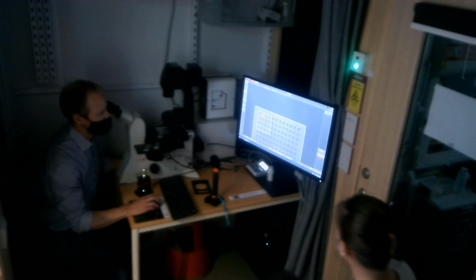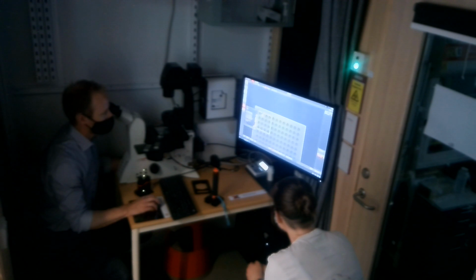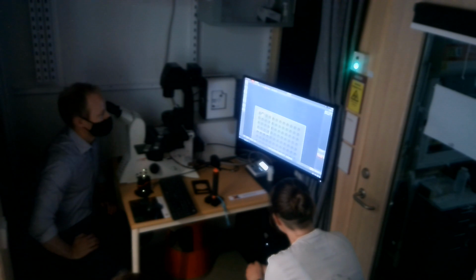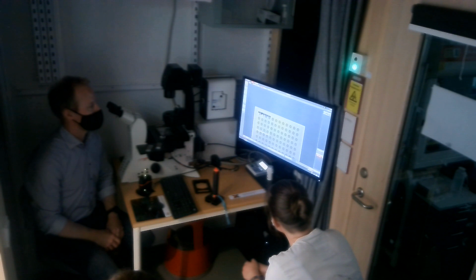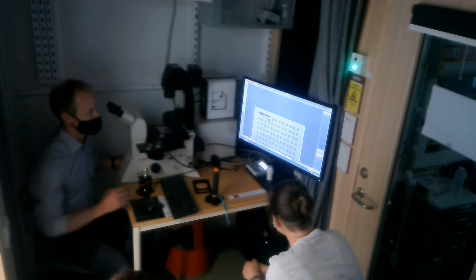As you can see, this is a lot of tiles. So I just want to get a sense, so I will decrease this. And now we can go to negative. I will do that. Now I have a few that I will take. And if I press preview instead, with the preview, it will not capture both, it will just do whatever channel I have. So I will press preview and just hopefully fairly quickly go through this and get us a sense of where the wells are. So this is also an option that you can use for getting an idea of where you want to image, basically. And this could go even faster if you had an even lower magnification objective.